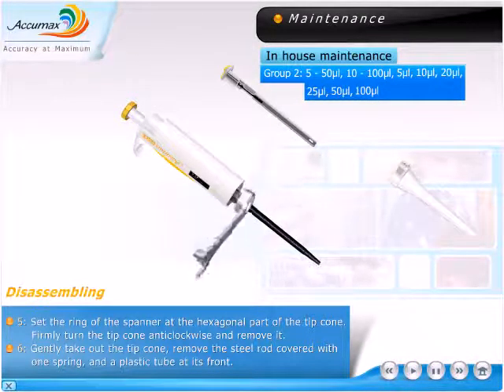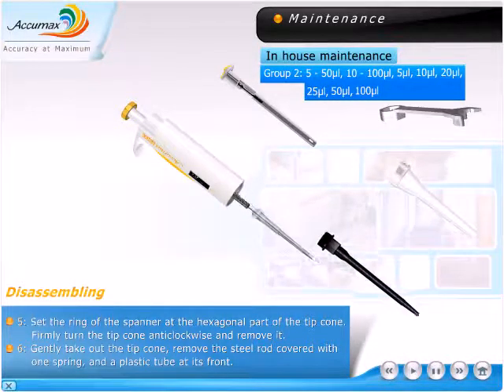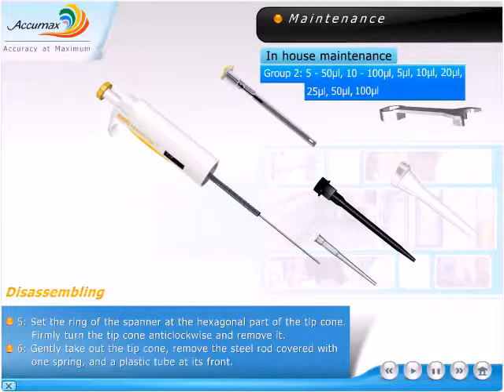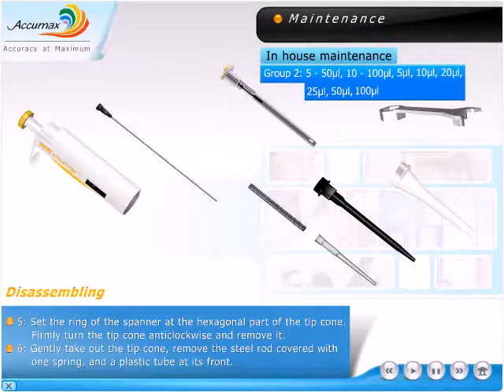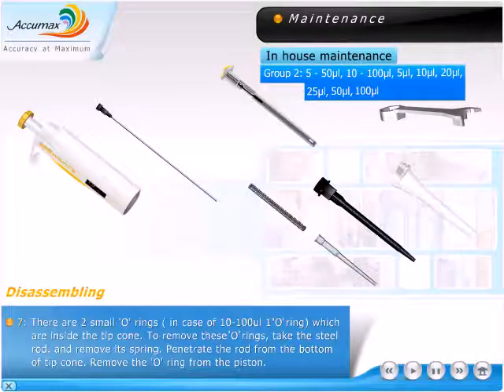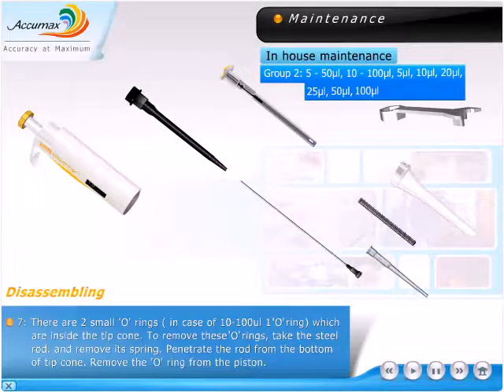Firmly turn the tip cone anti-clockwise and remove it. Gently take out the tip cone, remove the steel rod covered with one spring and a plastic tube at its front.